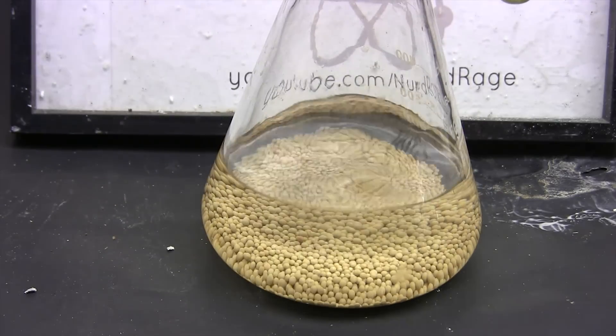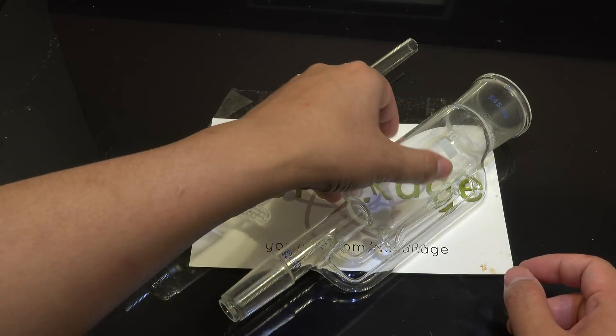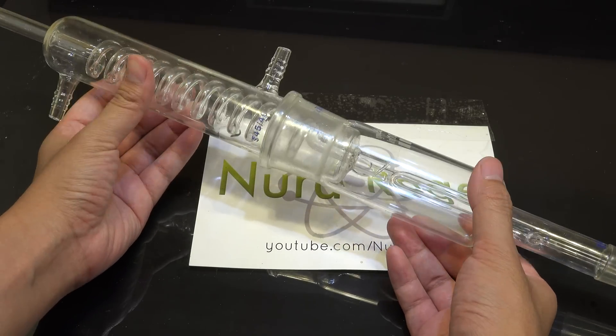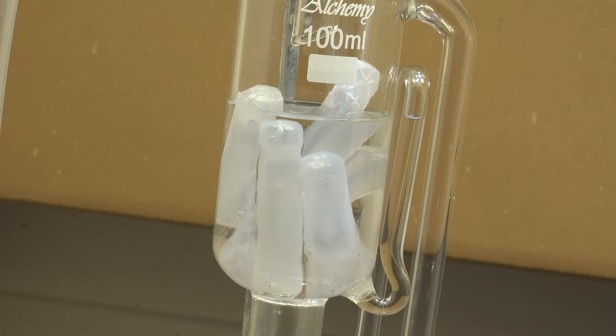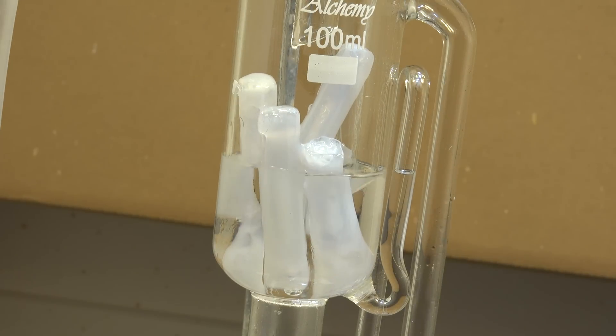Luckily for us there is a workaround. In a previous video I showed this apparatus — the Soxhlet extractor. For further information about it you can check the video description. But briefly, it allows us to condense vapor, dissolve or expose something to that condensate, and then return the dissolved substance to the boiling flask.